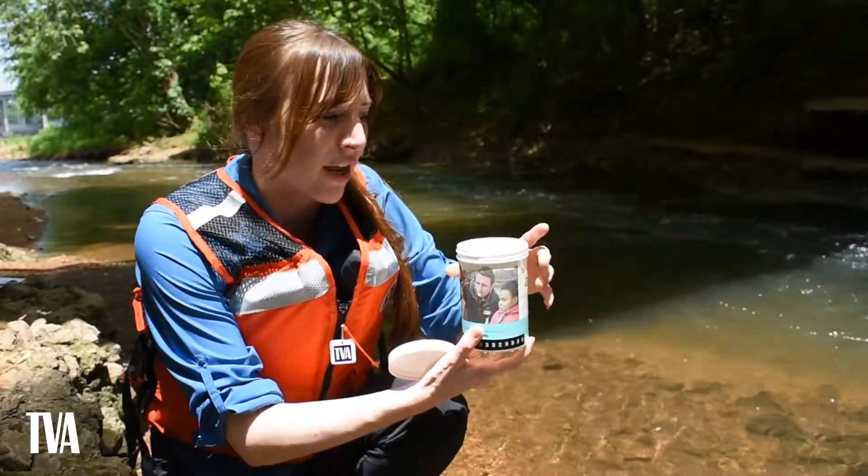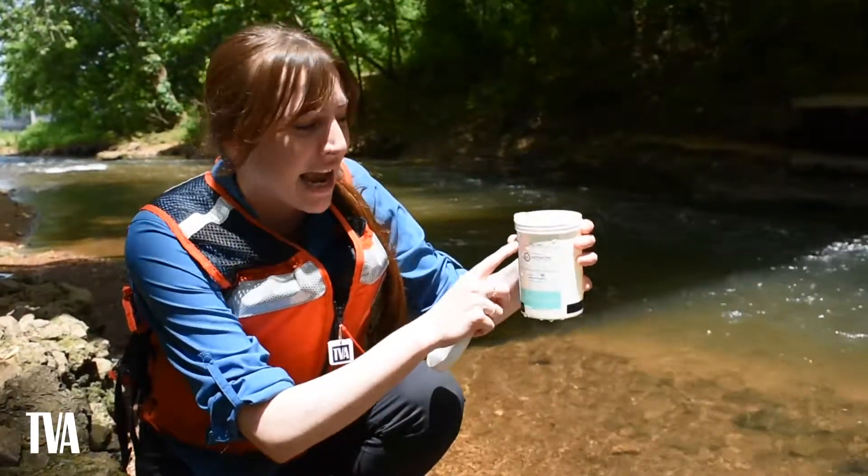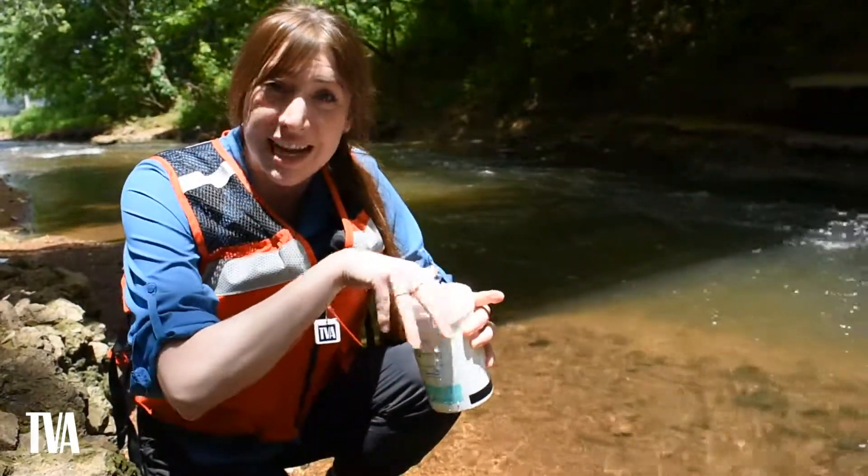Once you have your water temperature recorded, pour out some of the water to the fill line — the dotted line on the outside. Just pour a little bit out, then put the lid back on and take it back to your test station.